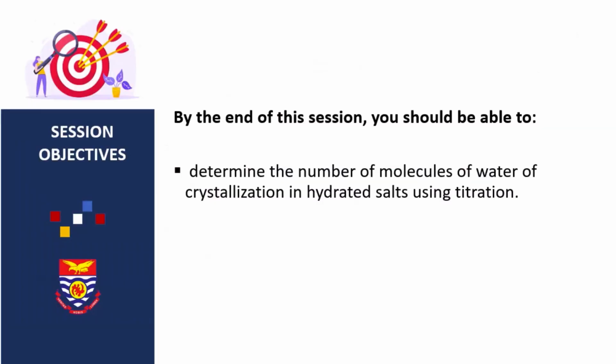By the end of this session, you should be able to determine the number of molecules of water of crystallization in hydrated salts using titration method. So basically, we are going to look at how you can determine the number of molecules of water of crystallization.